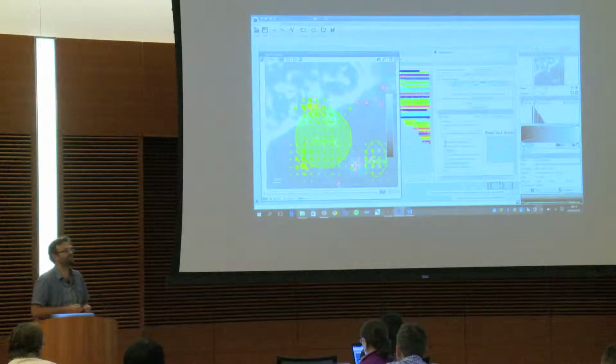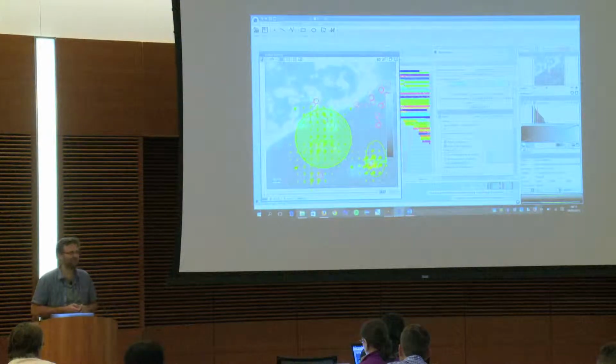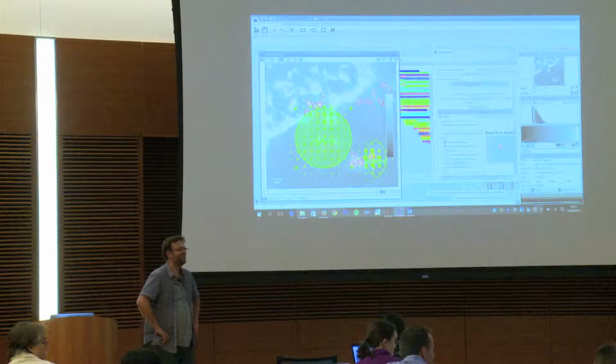And I'm not very happy with the rendering of the arrows that I made in 3D. It's not cool at all. Why are you laughing, Stephane?